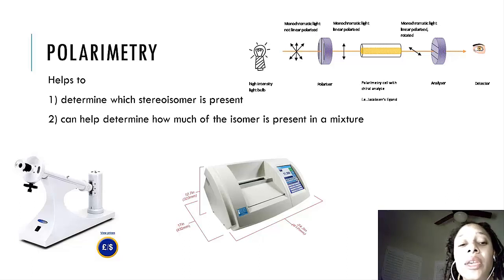The polarimeter, on the other hand, is going to help us distinguish one of 2 things. With limonene, we have the R-limonene and the S-limonene. Both of those 2 things have identical characteristics. Their refractive index is the same, GC mass spec is the same, the IR is the same, NMR is the same. What is different is how they interact with light in terms of moving light.